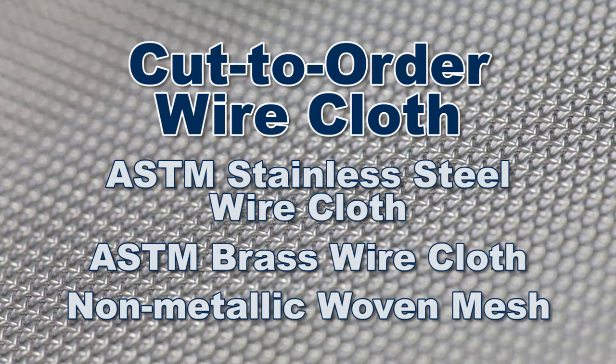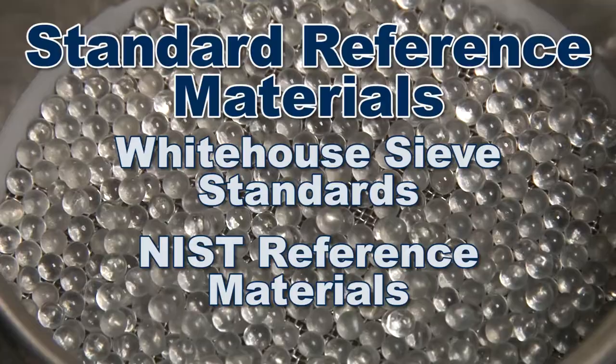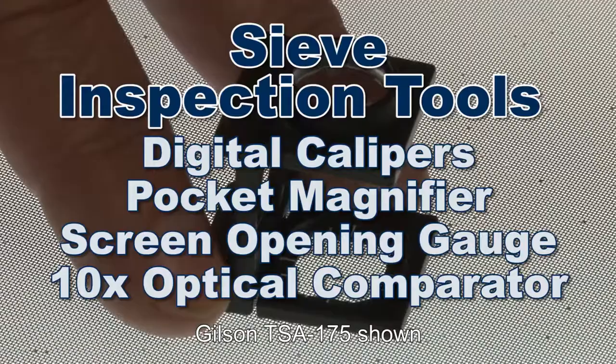Gilson also offers cut-to-order wire cloth for applications where conventional sieves are not practical, and standard reference materials with NIST traceable documentation for your internal quality control program, and sieve inspection tools for continued compliance to specified dimensions and tolerances.